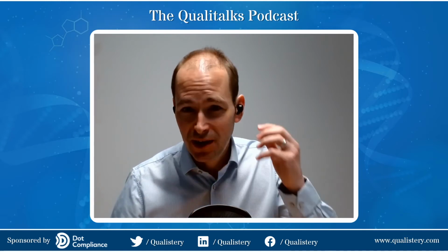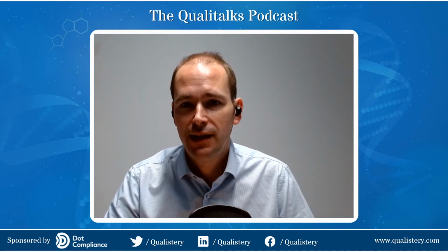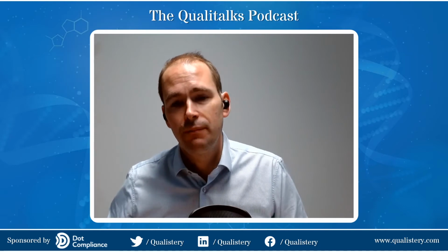Essentially, that's everything before we turn it on, I guess. So we want to see things like weld logs and the wiring, has that been done correctly? So we'll look over the whole machine. We'll walk through the process drawings and make sure that they're all correct as well. And once that's completed, we can then move on to the operational qualification.